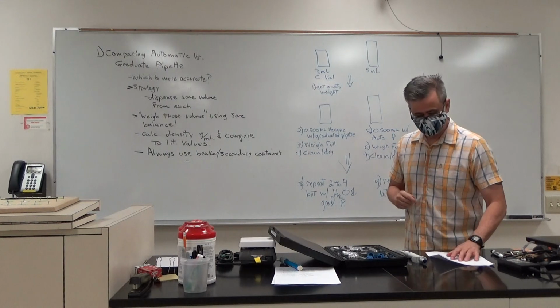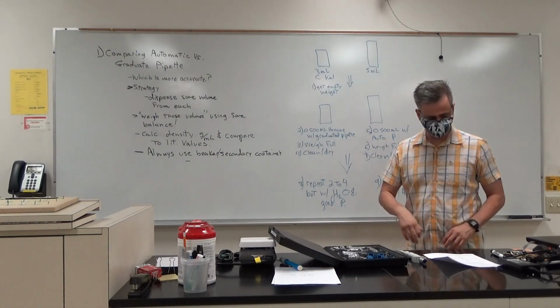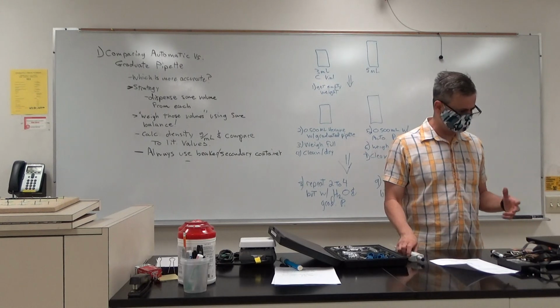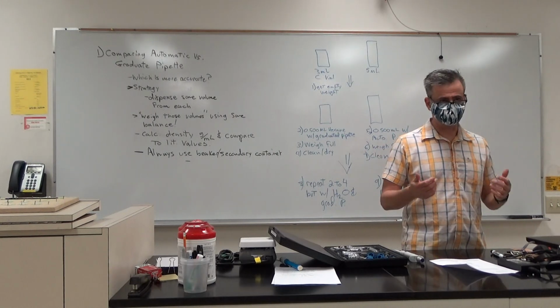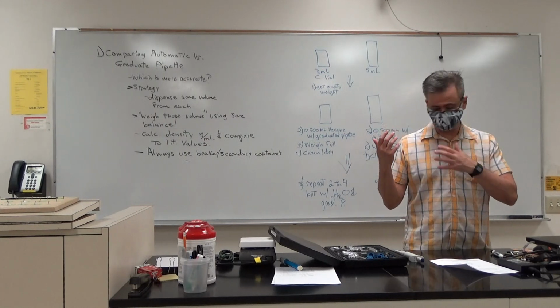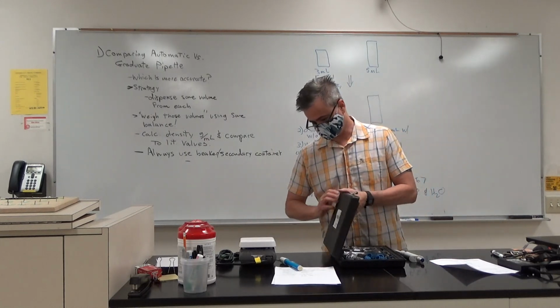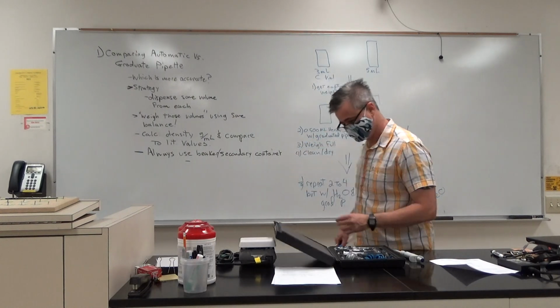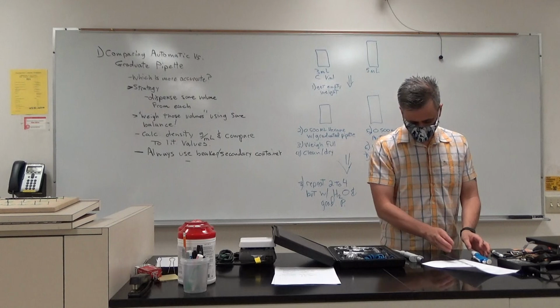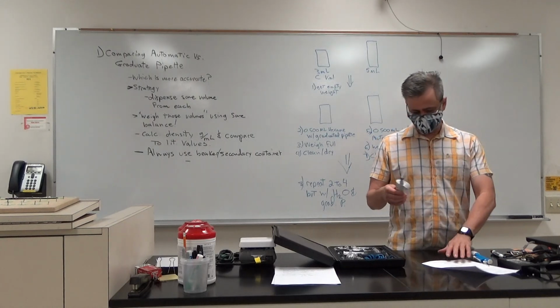Okay, a couple things. I know I'm explaining this in great detail. For some reason, students have gotten a little bit mixed up on this in past years. They end up getting 8 values instead of the 4 values that are prescribed here. So I came up with this new schematic picture to try to help with that. A couple things on how you operate these.